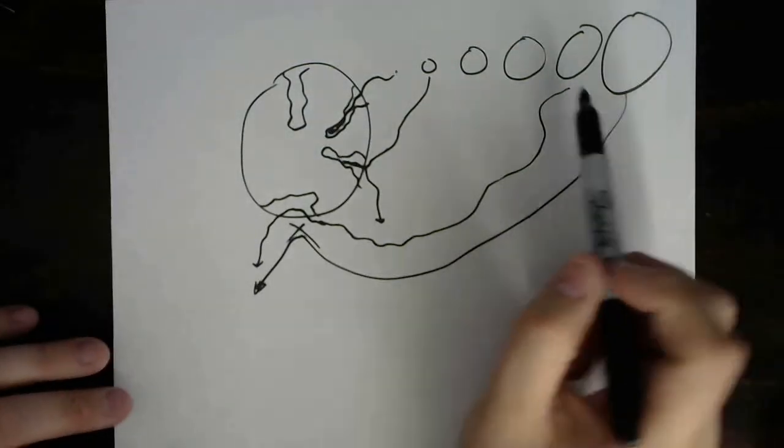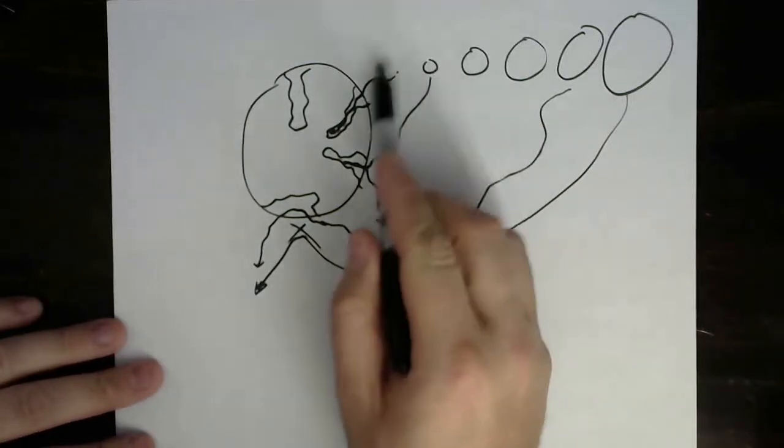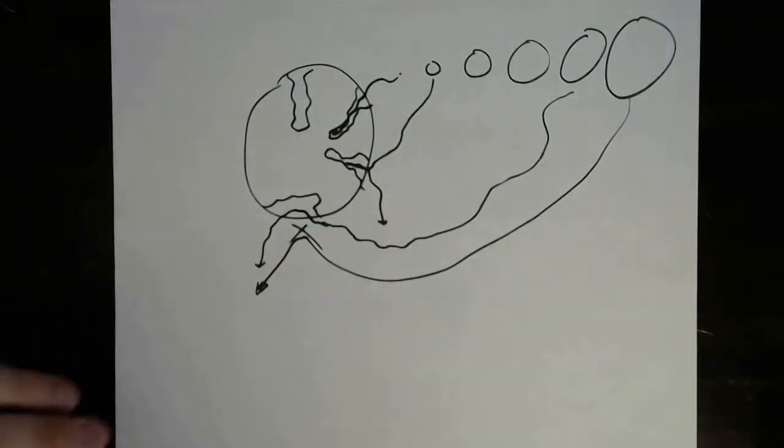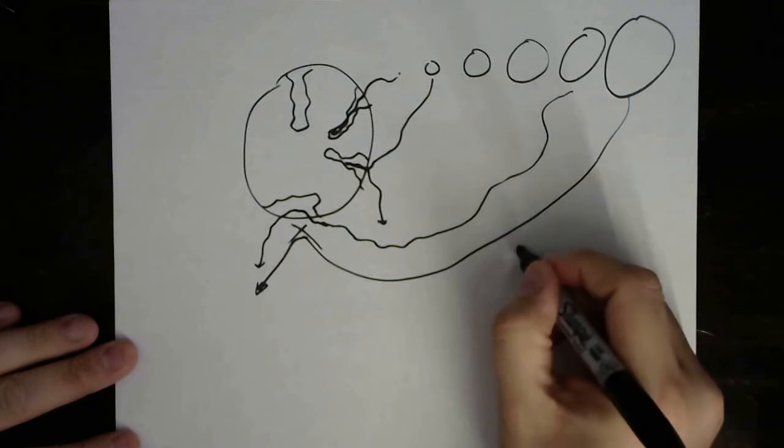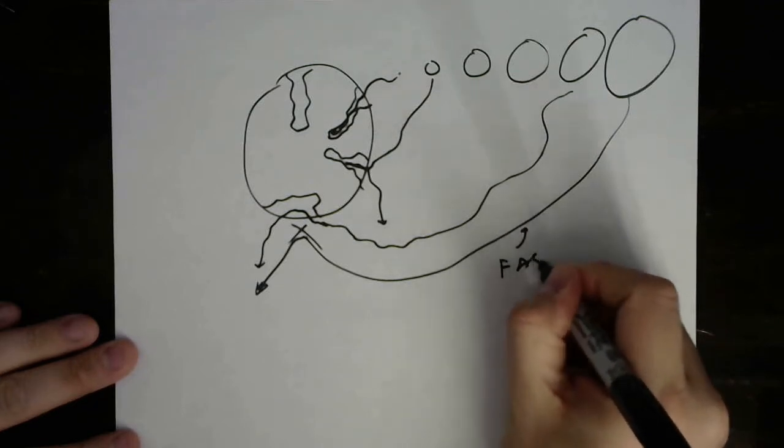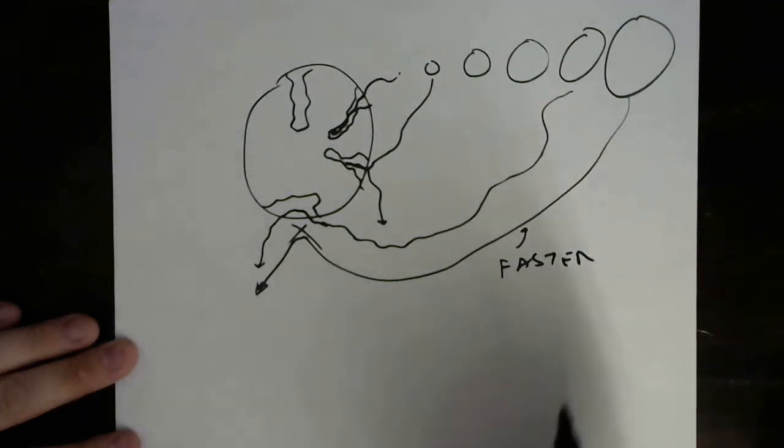And so this is the basis of separation where small things spend a lot more time in the stationary phase. When they're in the stationary phase, they are stationary. Surprise, surprise, spoiler alert. But when they're in the mobile phase, they are mobile. And so they are moving faster towards our detector. That means that these things move faster and come out first. They elute first.